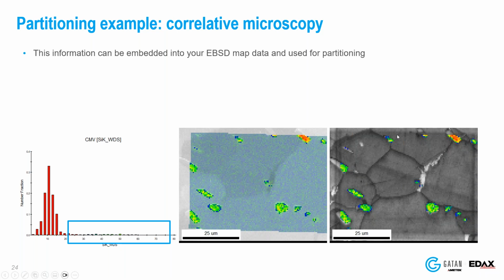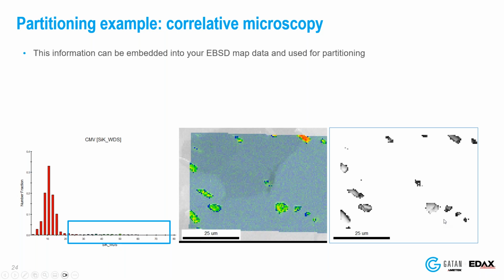And now I have those identified in my map. And then I can tell them apart and do any separate analysis. And this will also work if you have a color etching for different steel variants, for example, as long as the area is the same. So you can use that to partition and divide your data set.